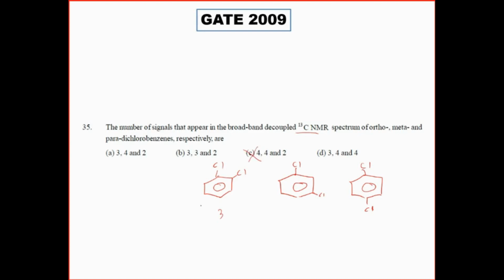Okay. So I can cut the molecule like this. So 1, 2, 3. Very good. In meta? 4. Very good. So I can rule out para, this is 2, option. So meta is 4, because we'll be having 1, 2, 3, 4.